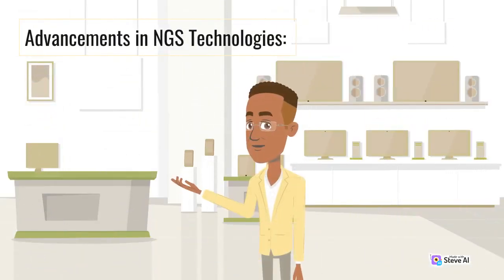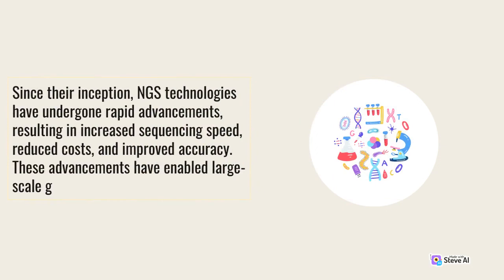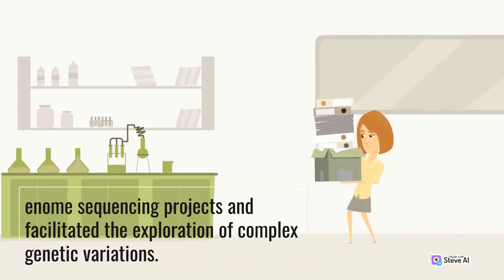Advancements in NGS technologies. Since their inception, NGS technologies have undergone rapid advancements, resulting in increased sequencing speed, reduced costs, and improved accuracy. These advancements have enabled large-scale genome sequencing projects and facilitated the exploration of complex genetic variations.